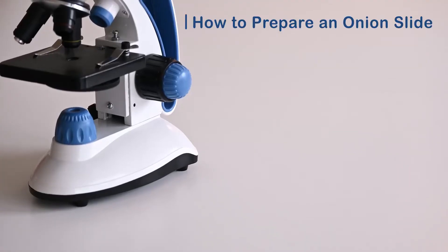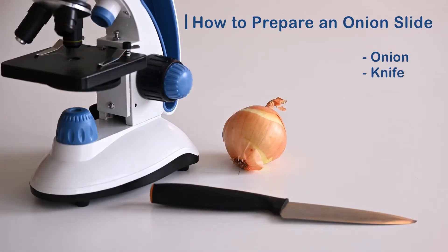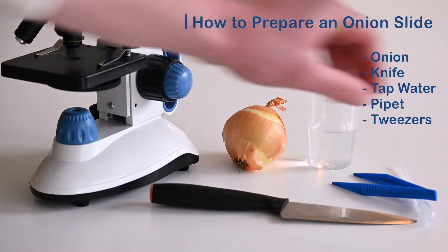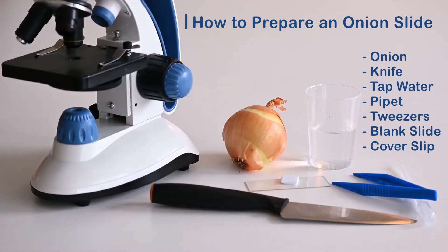The things we will be using are an onion — no special kind, any onion will do — a knife, some tap water, the pipette and tweezers from the lab kit, and a blank slide and coverslip which also comes with the microscope.